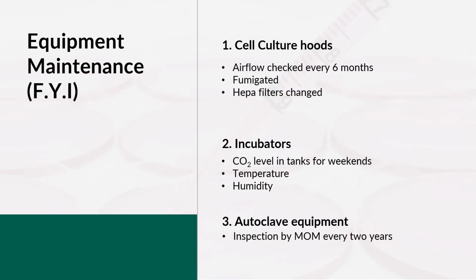This will help to maintain the effectiveness of the autoclave and ensure that you truly sterilize all the equipment that you are using. Okay, all the sterilization conditions are met based on the required standards. So basically, these are the key things for the three key equipments.